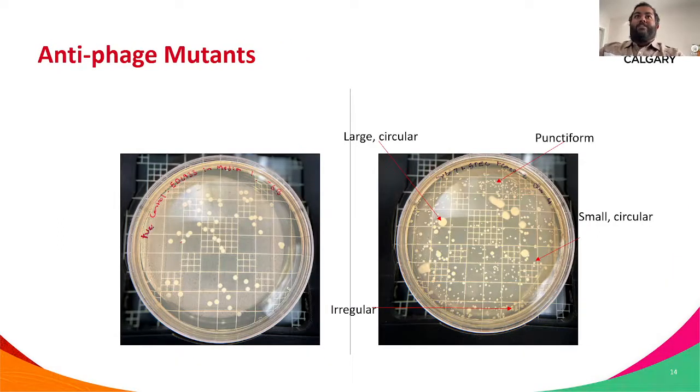Another interesting thing to note was that of the bacteria treated with phages that was counted, we did see some mutated STEC as noted by changes in the colony morphology when compared to the regular colony morphology of EDL933.